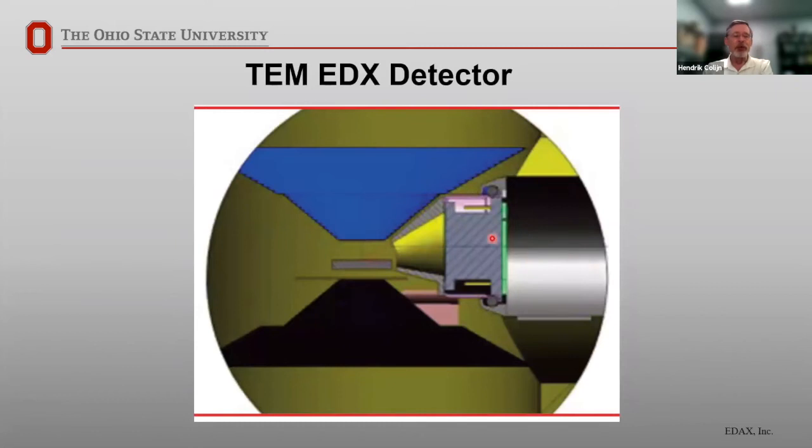So that was a schematic drawing. This is something a little bit more to scale. You have your pole pieces, upper and lower. This would be looking at the end of the sample rod sitting in here, and you can see how tight the quarters are. You have your objective aperture sitting here, and then a collimator, and your detector would be sitting roughly right about here. One thing you notice is how large an angle it subtends. We will often talk about the takeoff angle, but that's only to the midpoint of the detector. The detector actually extends down below the plane of the sample.